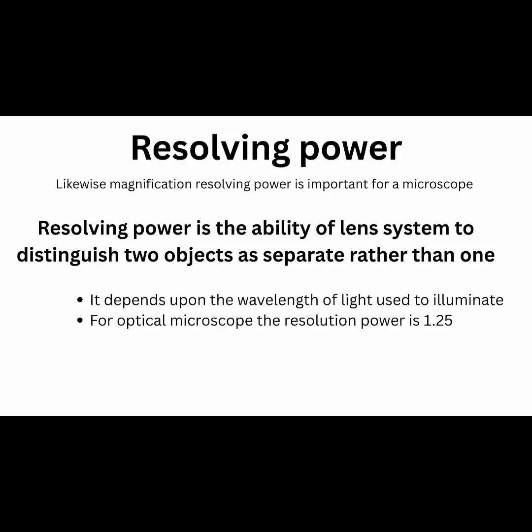So what does it depend upon? It depends upon the wavelength of the light we use. Also, for the optical microscope, the resolution power is 1.25, which is fixed for the optical or light microscope.